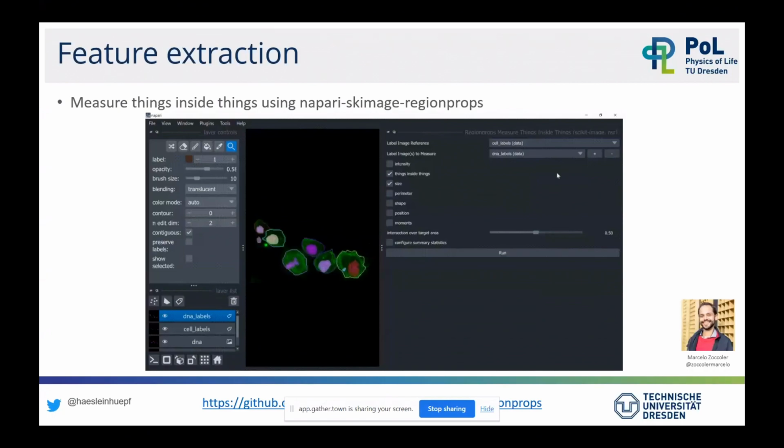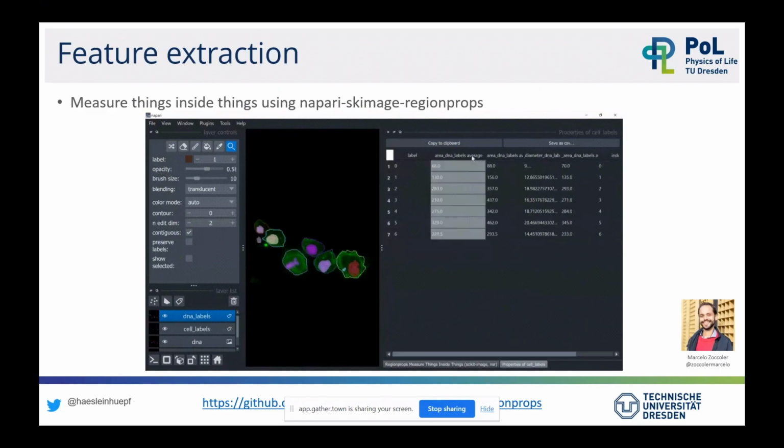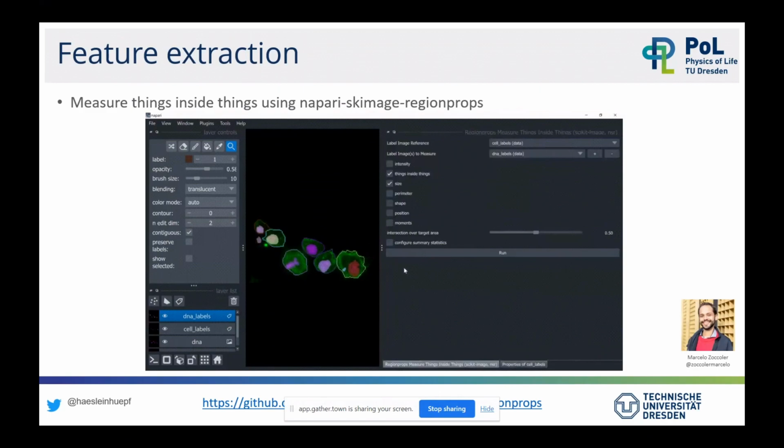This is a very common task here on campus. So plenty of projects arrive where these kind of things are necessary, and it's super hard to generalize that. So if you could theoretically all the time write a new ImageJ macro or a new Python script for solving these kind of problems. So Marcelo took the challenge to program a user interface for that, which is very interactive and allows you to tune the situation, what you want to do.